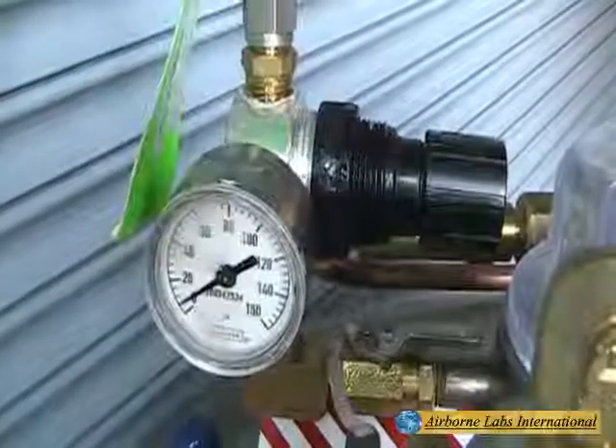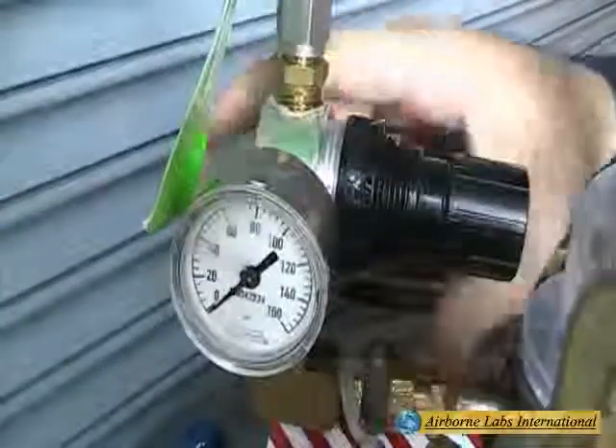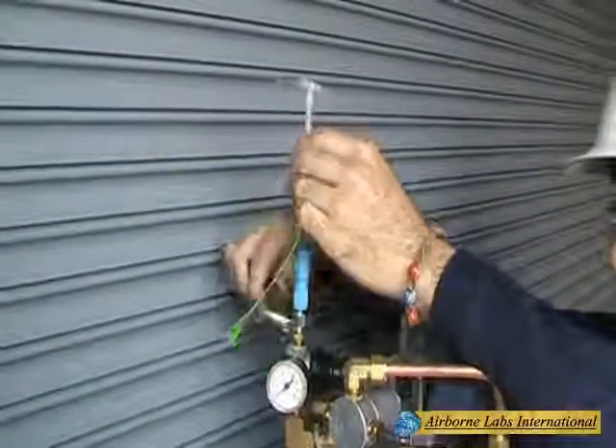Next, shut off the petcock valve and bleed off all line pressure. Remove the T-Fitting and replace all small accessories back into the supplied plastic container.